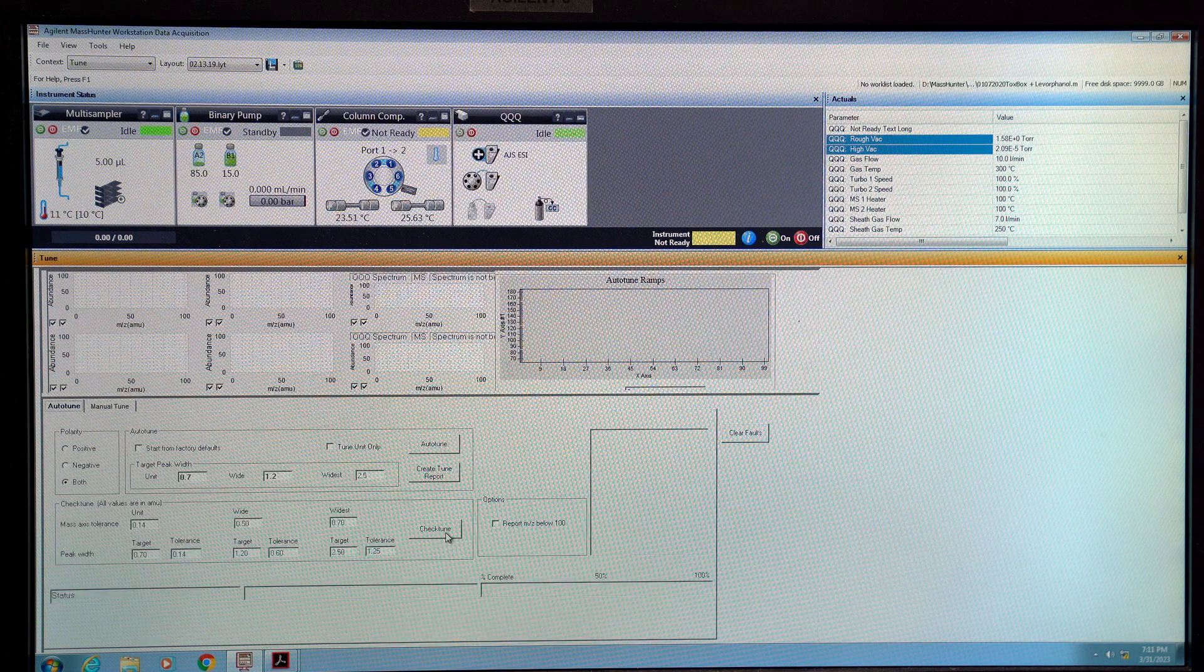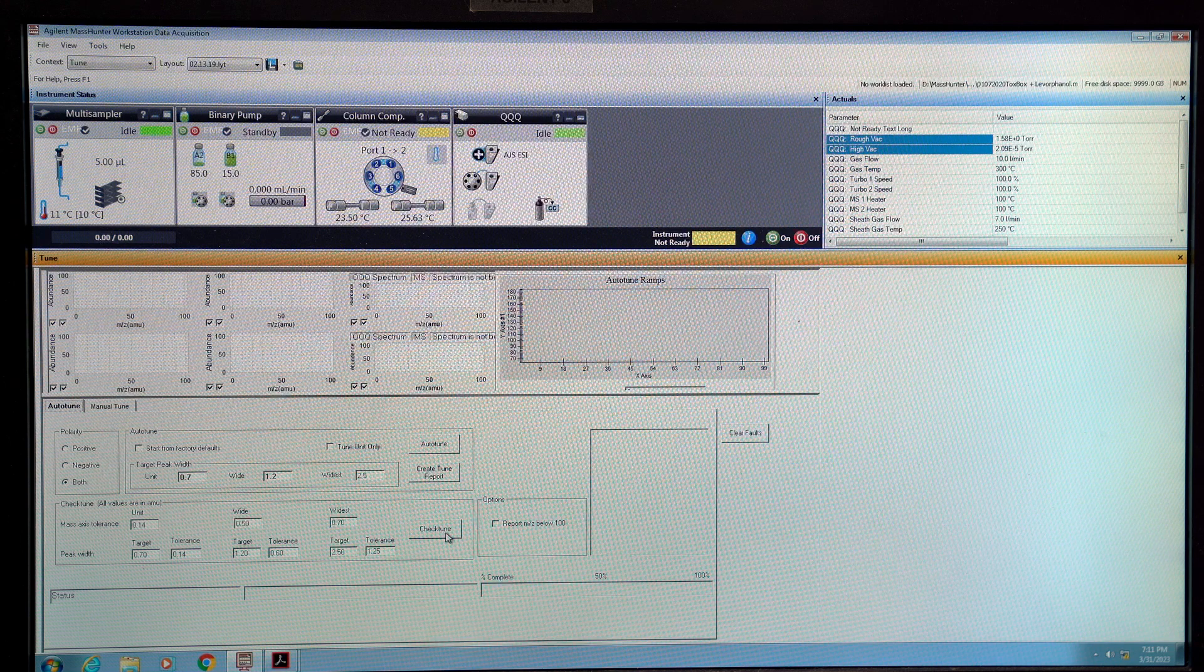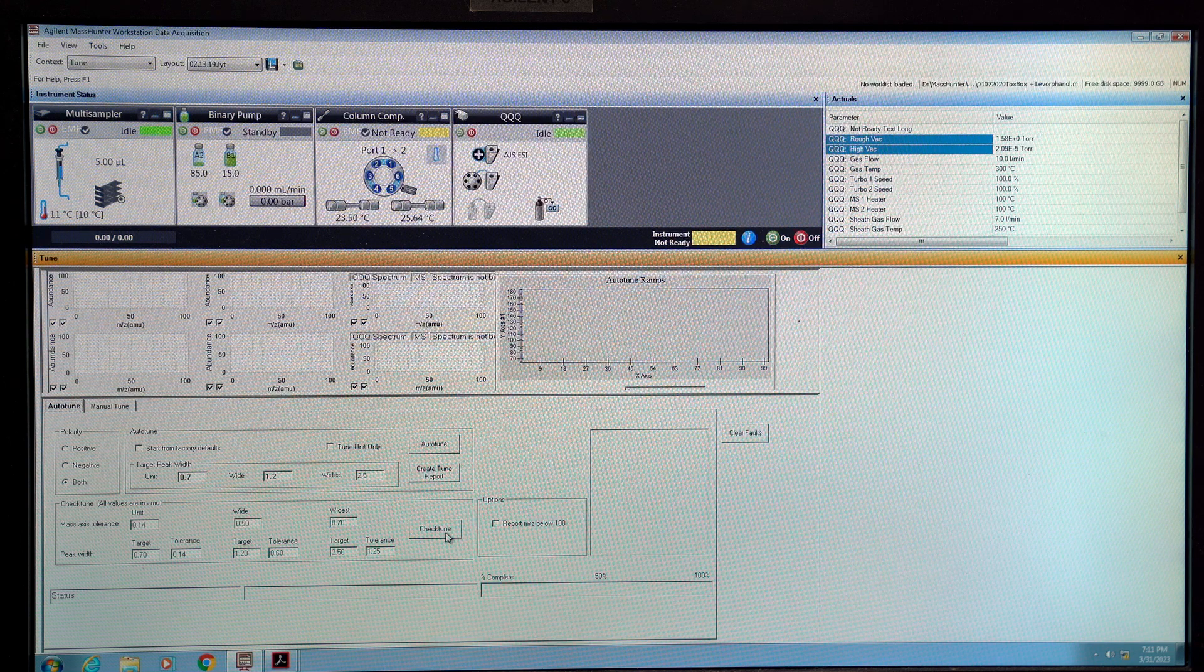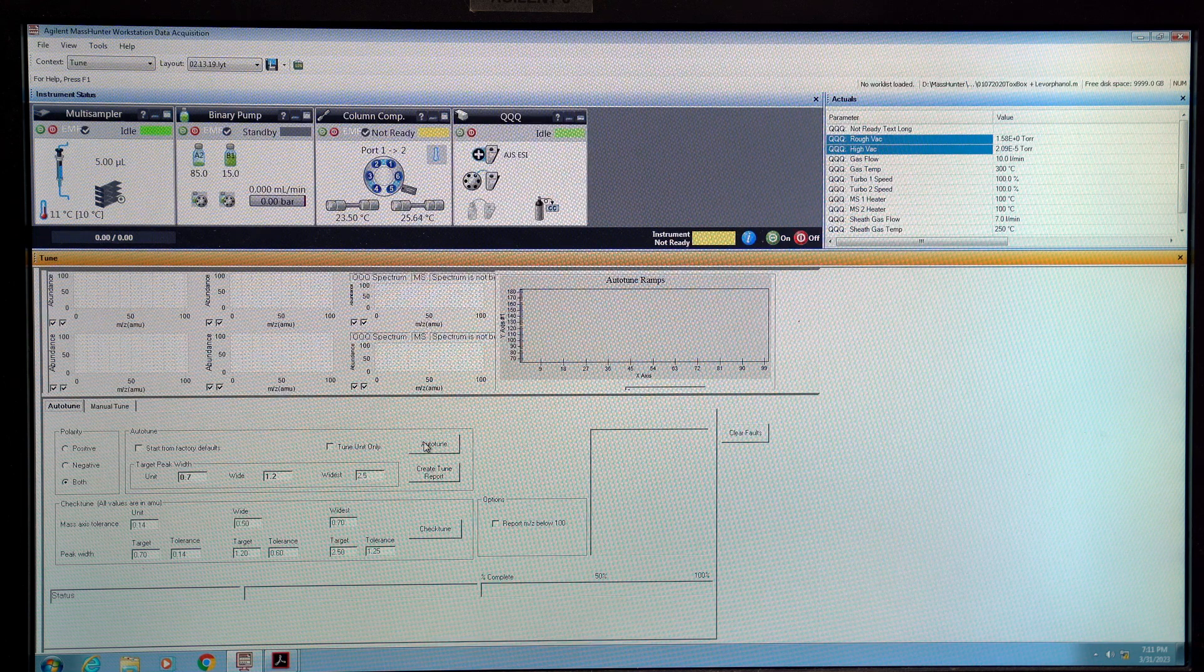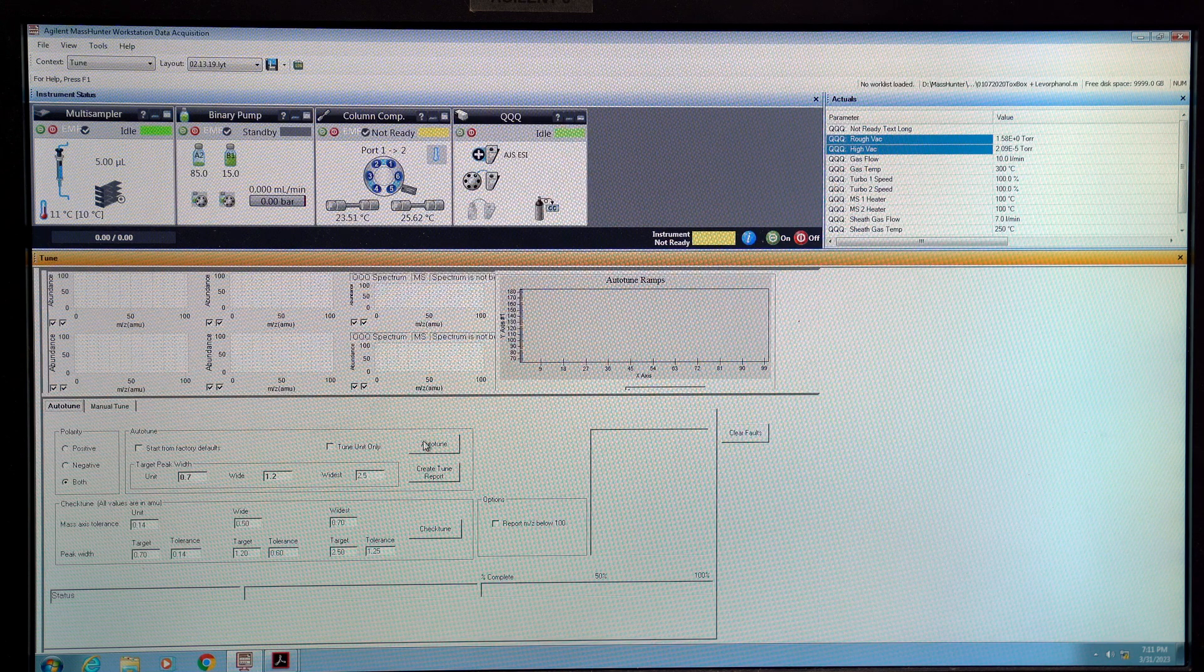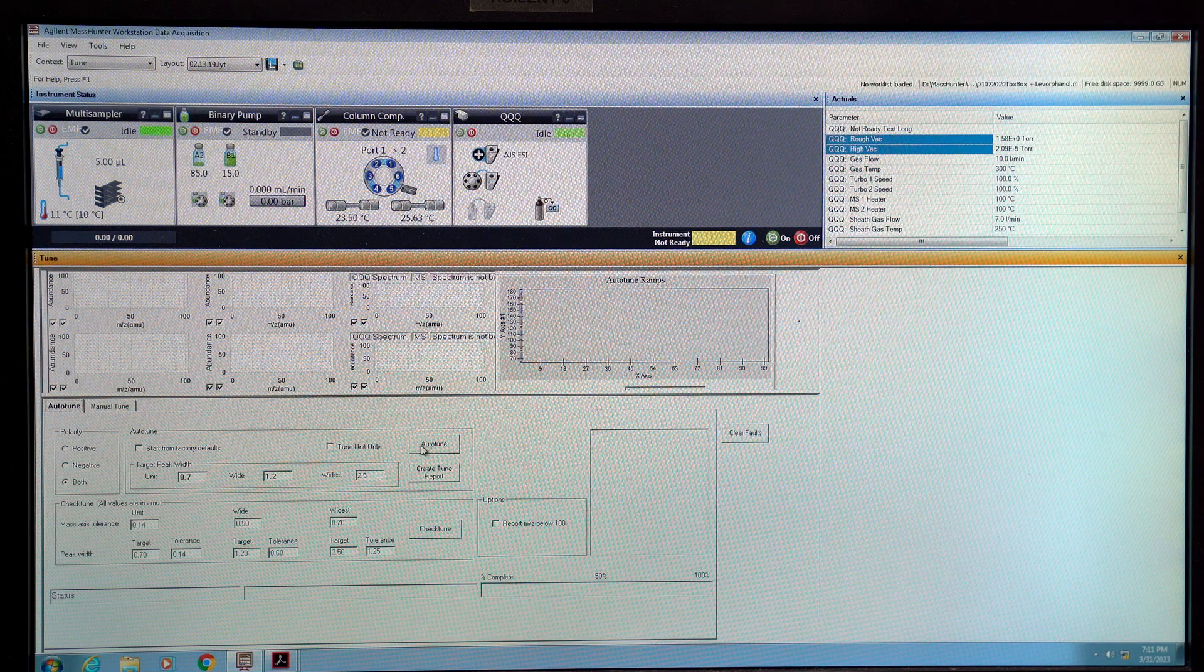Now if that fails again then you'll want to click auto tune and that should work but this is going to take a while. It's going to take maybe an hour.